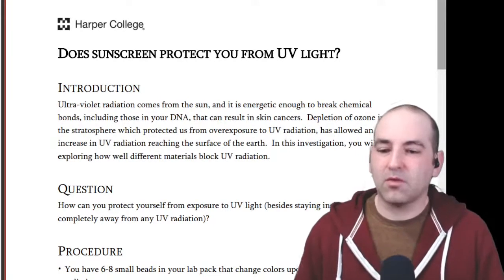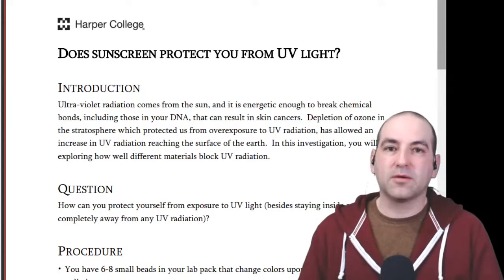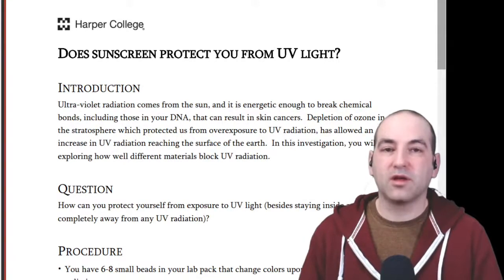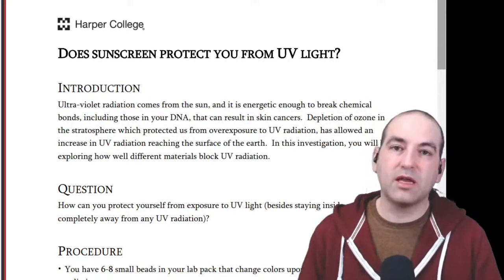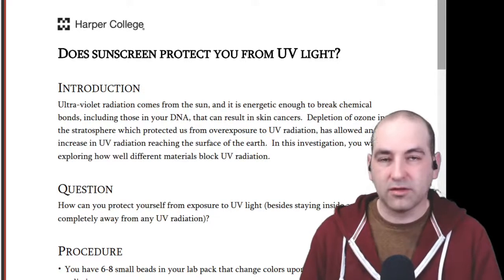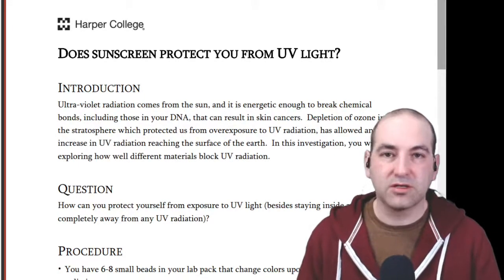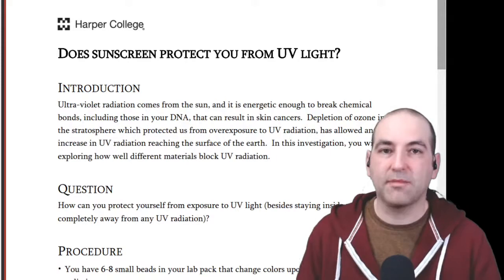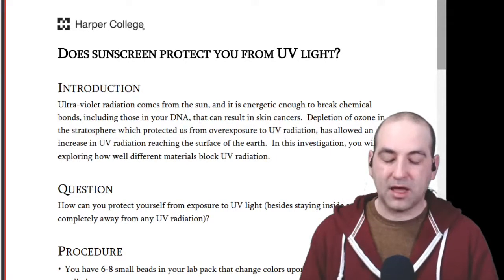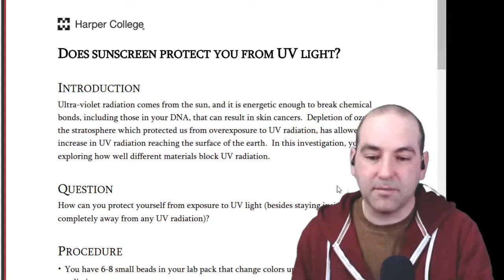So with this lab, you are designing an experiment. And at this point in the semester, you've designed a lot of experiments. You've done at-home experiments. You've done other things from class that were more open-ended. But this is definitely the type of experiment that is not just follow the directions. You have to figure out what you're going to do, how you're going to measure these things, how you're going to set it up, how you're going to properly control your experiment, all of that. And because of that, I think it's a really good activity.